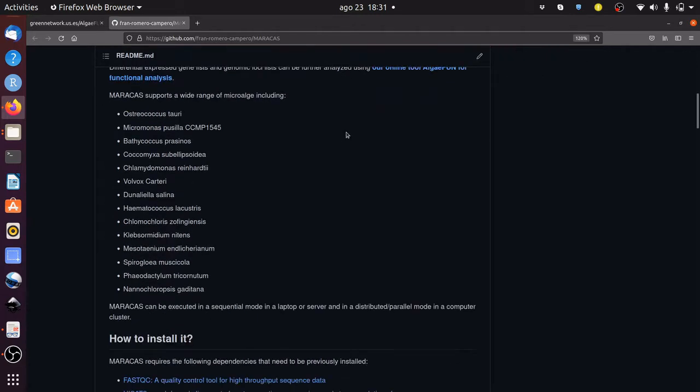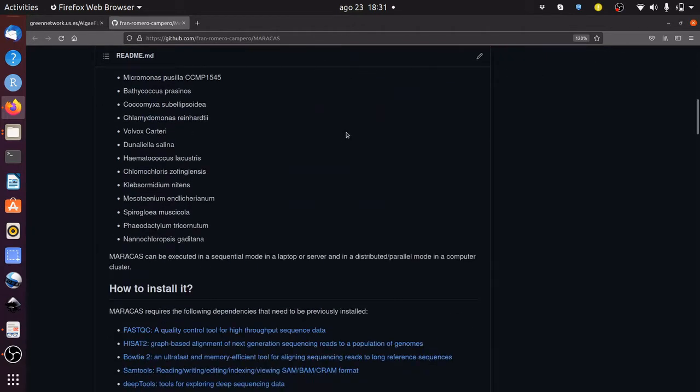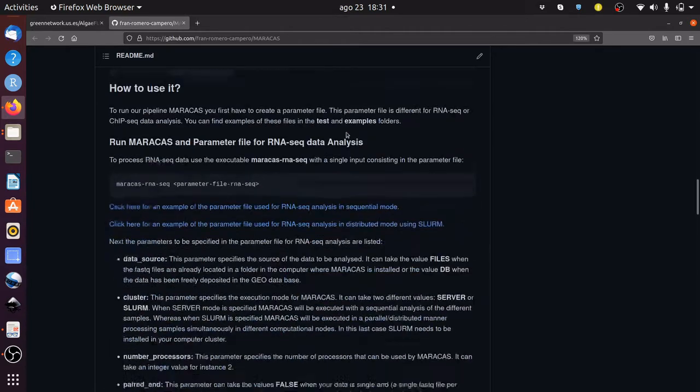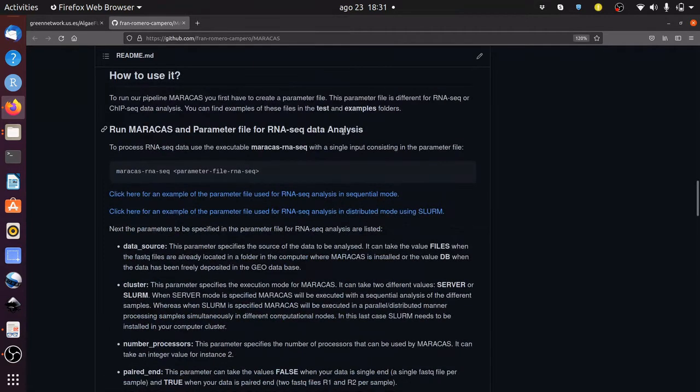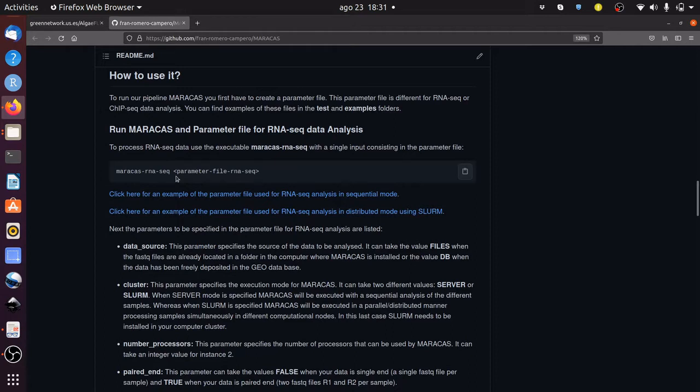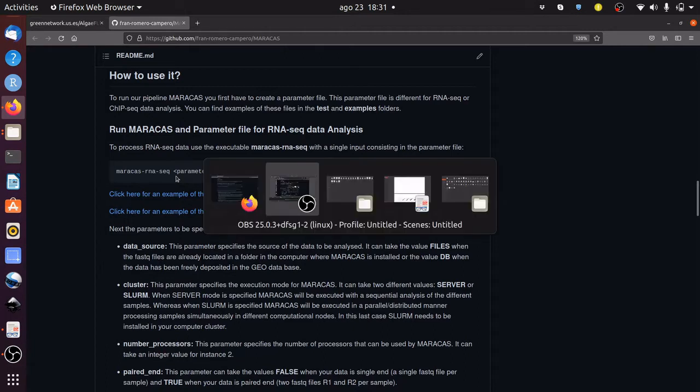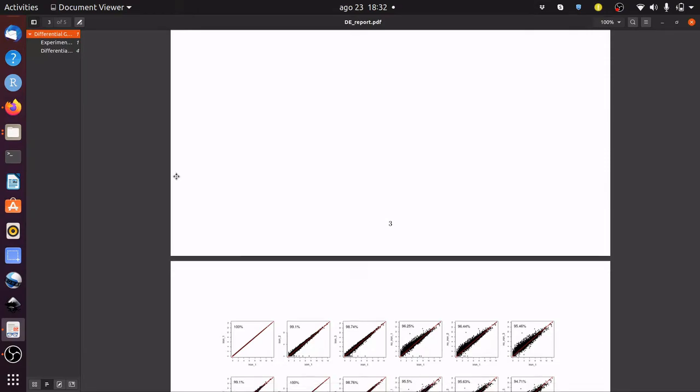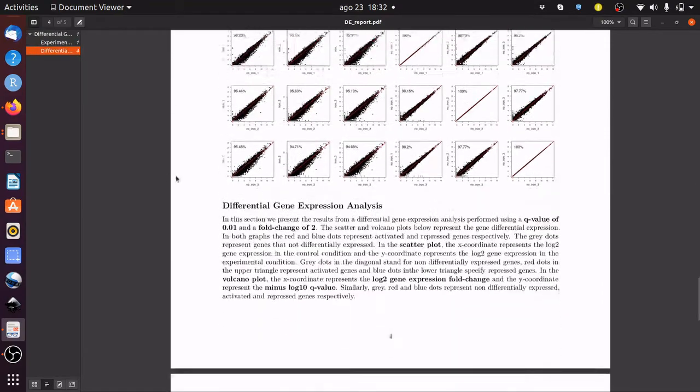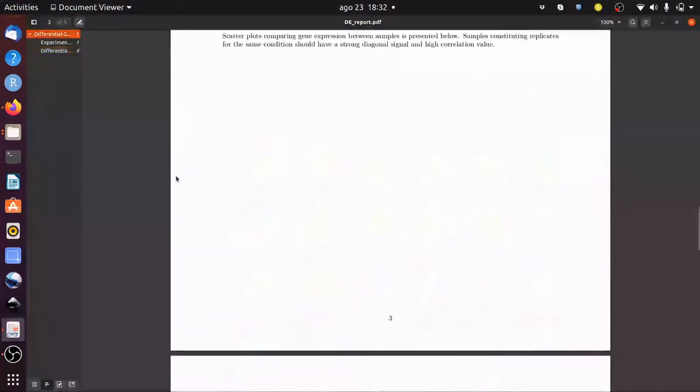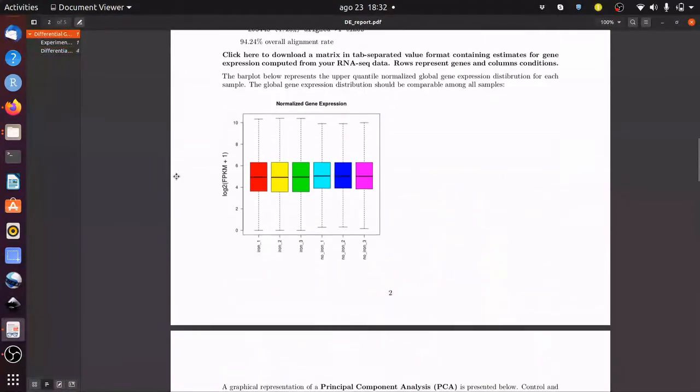Briefly, Maracas consists of two fully automatic pipelines. On the one hand, Maracas RNA-seq receives as input transcriptomic RNA-seq data specified in a parameter file, performs differential gene expression analysis, and returns lists of activated and repressed genes among other results that are presented in reports in HTML and PDF format. Here you have an example of the PDF report with the output from an RNA-seq data analysis performed with Maracas.